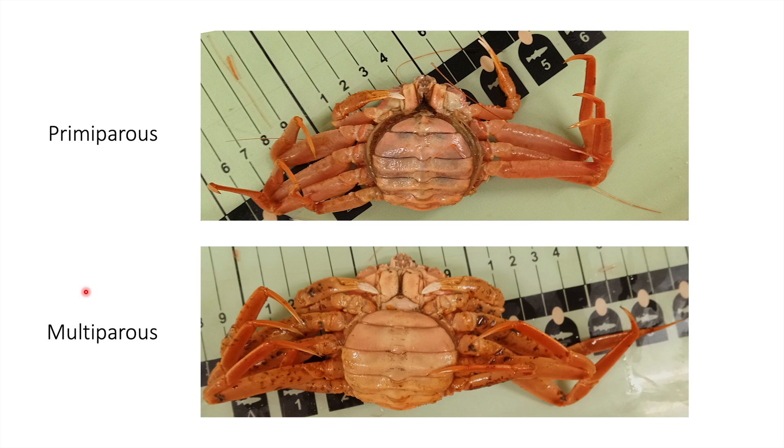A female snow crab is considered primipyrus if she is brooding her first clutch of eggs, and multipyrus if she is brooding subsequent clutches. This can be determined through assessing the age of the shell.